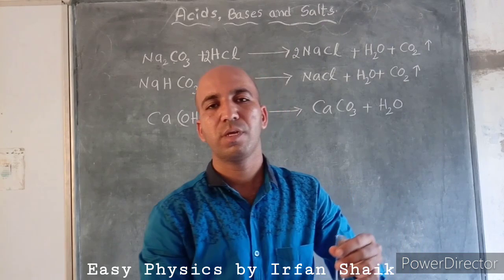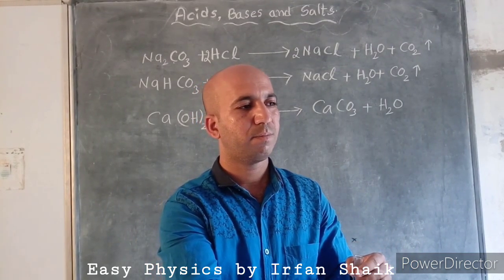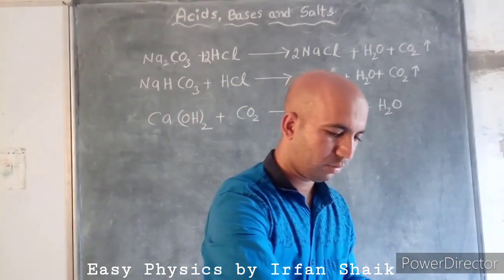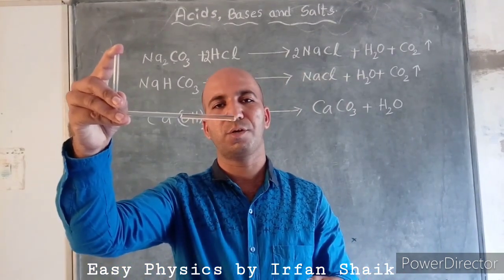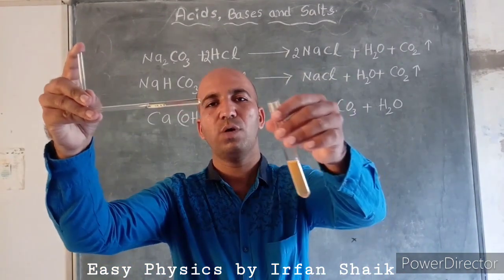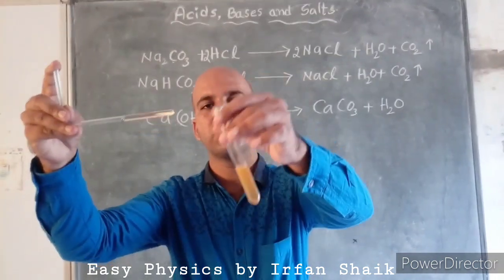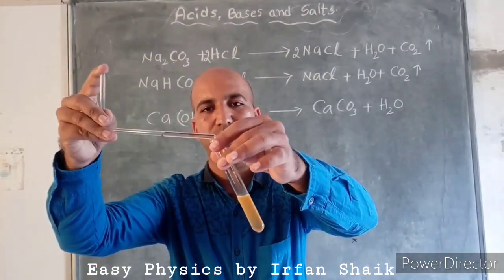I will take a few drops of hydrochloric acid. So here I have taken some hydrochloric acid. Now I am going to add this hydrochloric acid to this yellow colored solution. Observe carefully how the color changes.